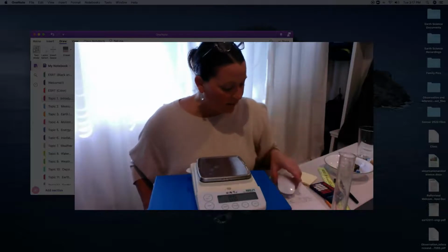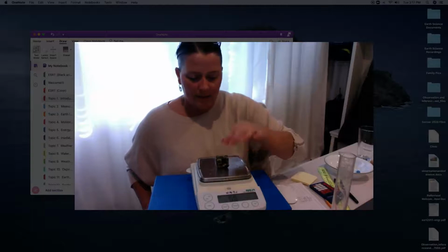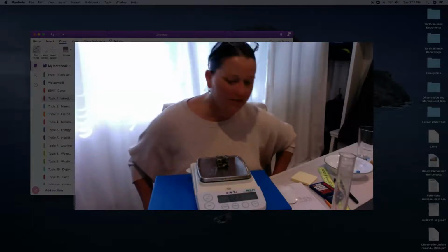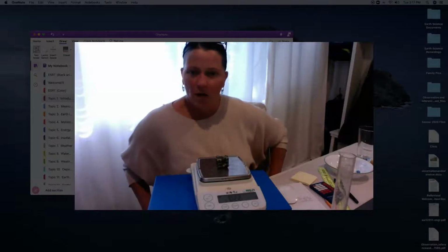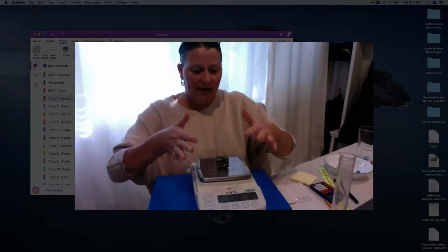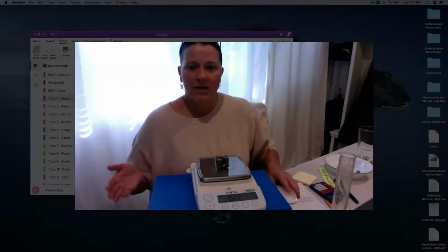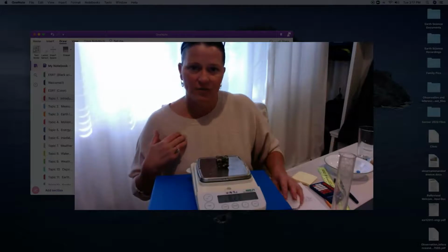And then my last and final item that I'm going to be finding the density for is a piece of granite. Again, your kitchen countertops are made up of that, you'll see them in pizzerias. And that comes out to 55.0. So right now, all I did is I found the mass of each item and I read it out to you. We will go back right now and make sure that we have that recorded on our report sheet. I think it's easier to do that way.